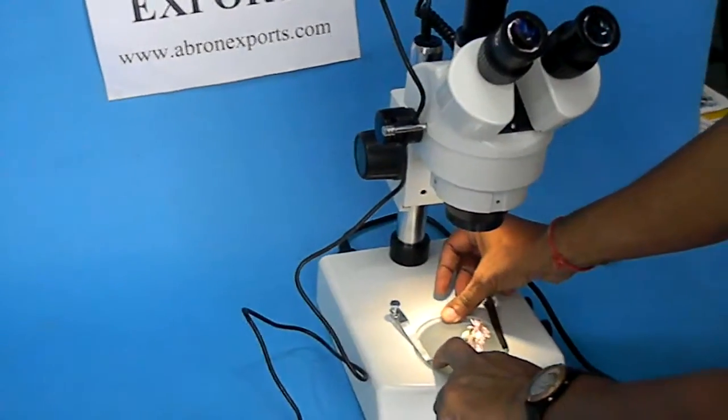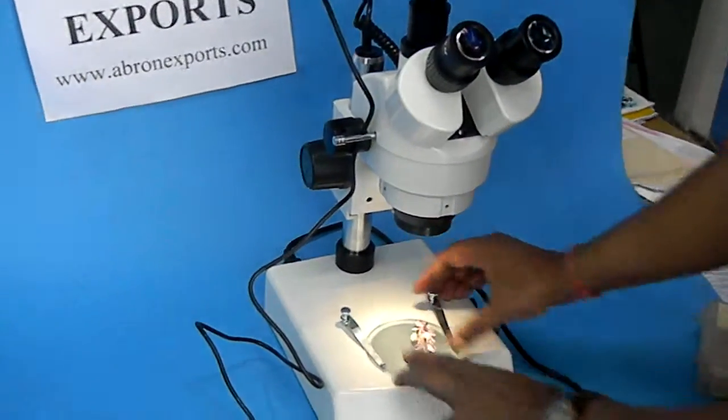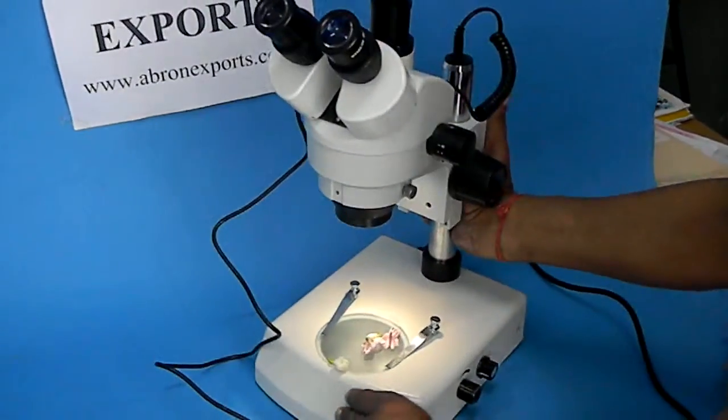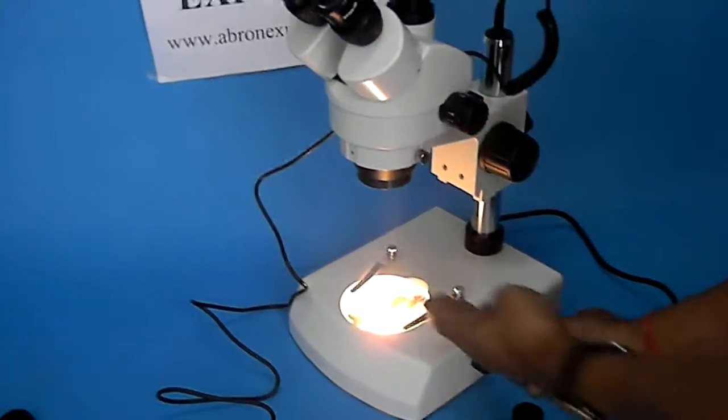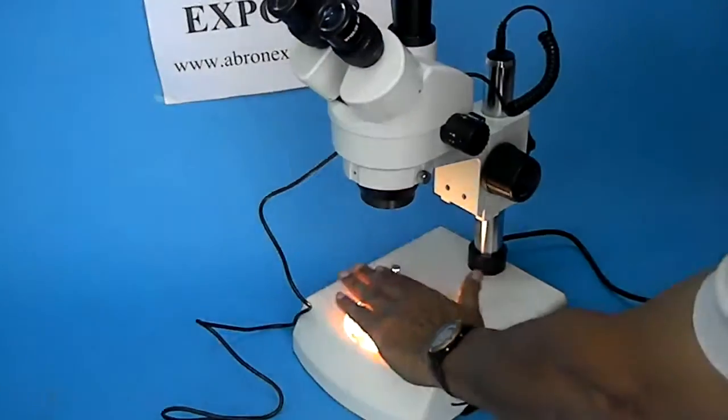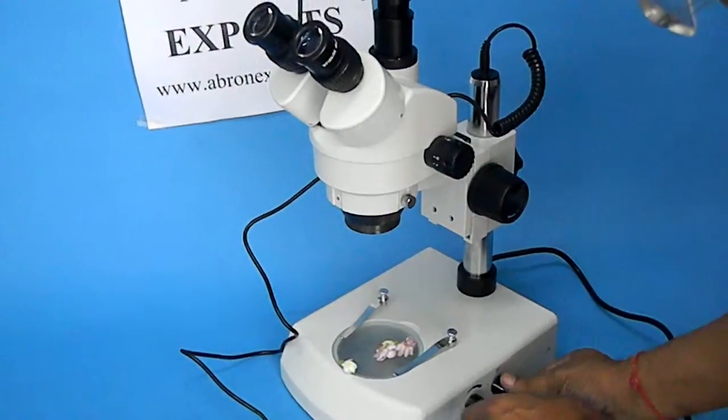You can move this. There is a light at the bottom. There are two selectable lights. This is from bottom. Second is from both the angles.